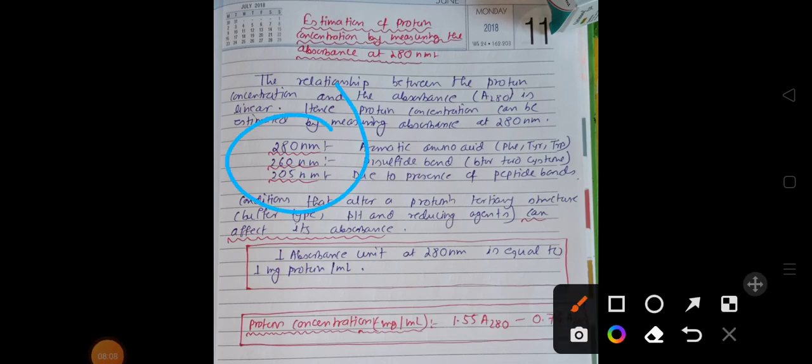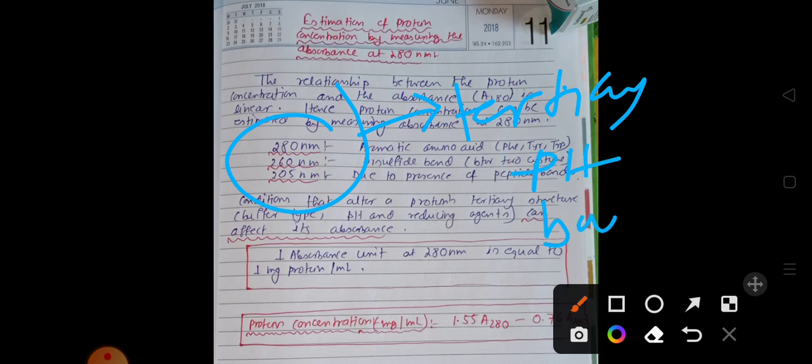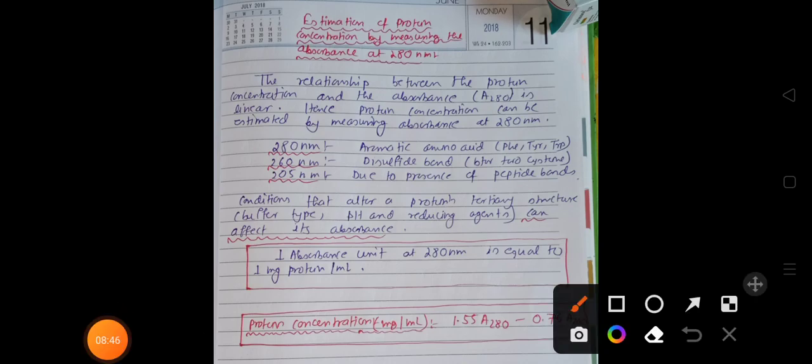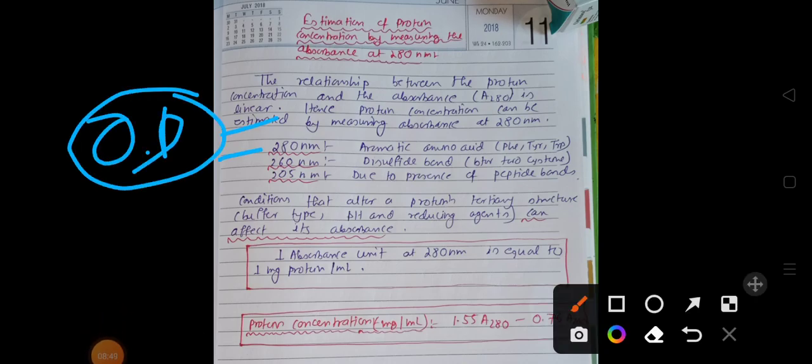But there are some problems that we face when we use a colorimetric technique or any kind of spectroscopic technique for protein concentration measurement. What are these problems? First of all, the conditions that determine the tertiary structure of the protein, for example the pH value, the buffer, the reducing agent, will affect the absorption of the protein. Because try to understand, if the pH, buffer or reducing agent amount is changed, then the charge of the protein as well as the tertiary structure can change, and it may affect the absorption. More or less we can get an OD value, which is the absorption value.